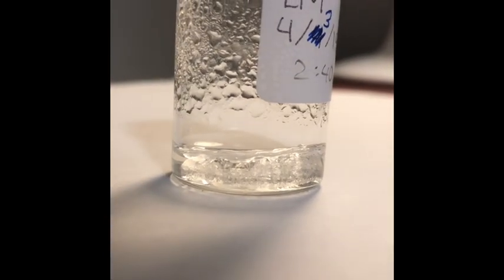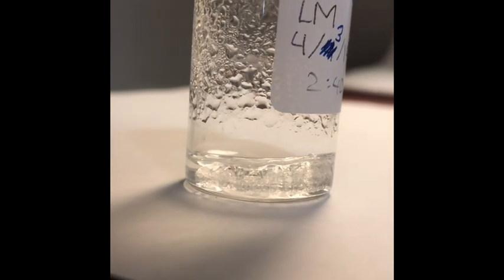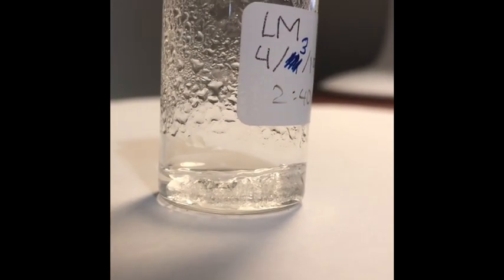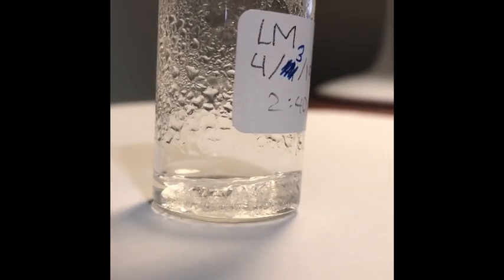Over the past couple of weeks, my alum crystals have grown quite a bit. At this point, the tallest crystal that I have is about 0.8 centimeters in height, and the crystals appear to be pretty clear, and they cover about 40% of the inside edge of the vial.